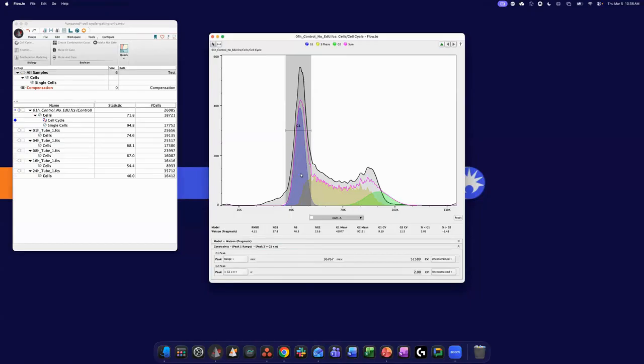So I want G1 times 2 as the default, because remember, for G1 we usually assume a twofold change for the G2. That's why it defaults to 2. But maybe in my model, it's not exactly 2, right? Maybe it's 1.95. And look at that, that brought my model down just a bit. Right now, we're back at 3.45. I could even push the limits a bit to 1.9. Okay, maybe that overdid it. I'll go back to 1.95.